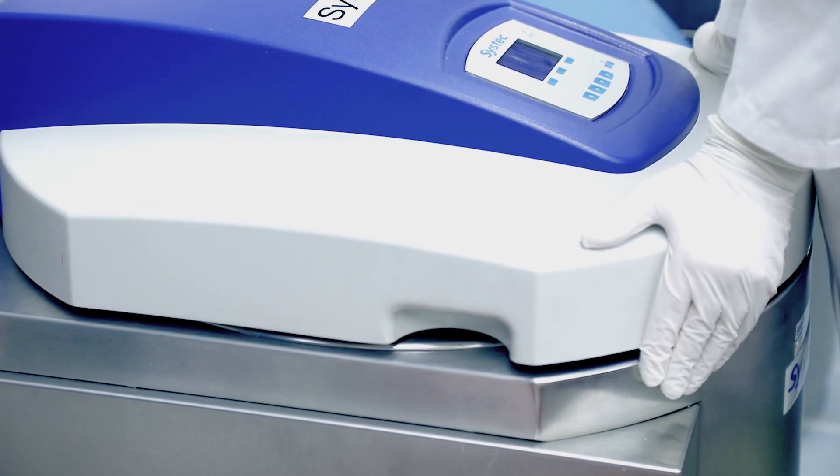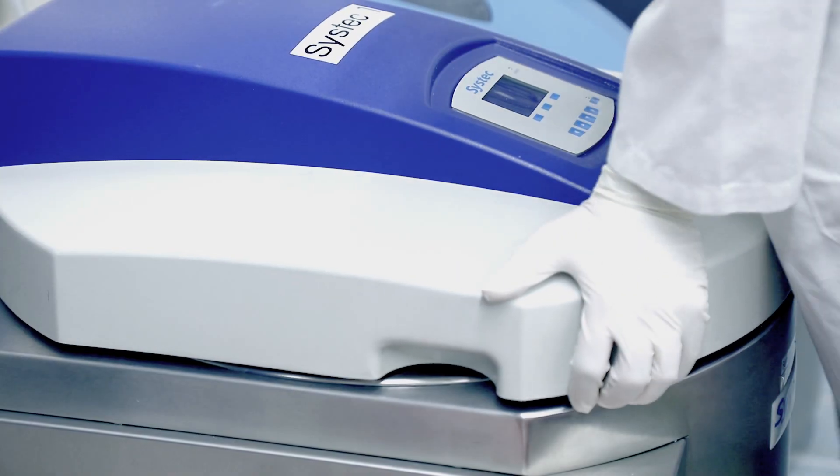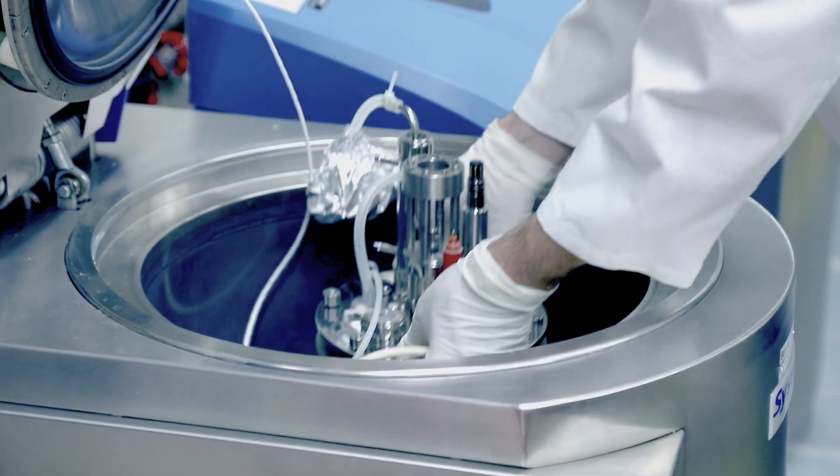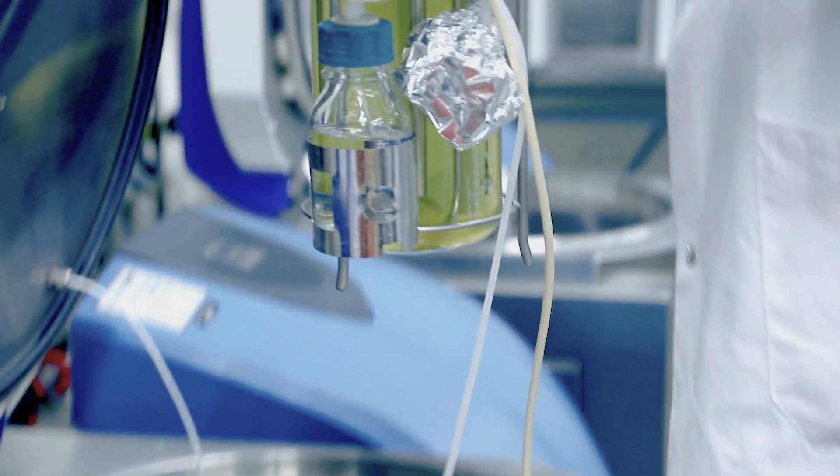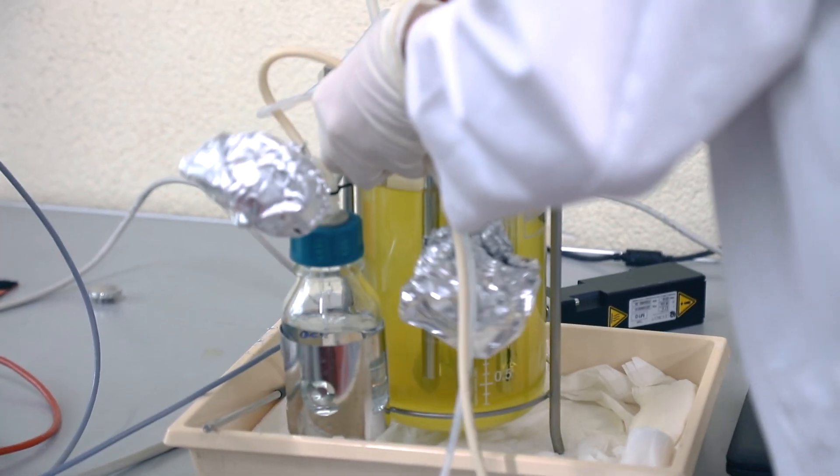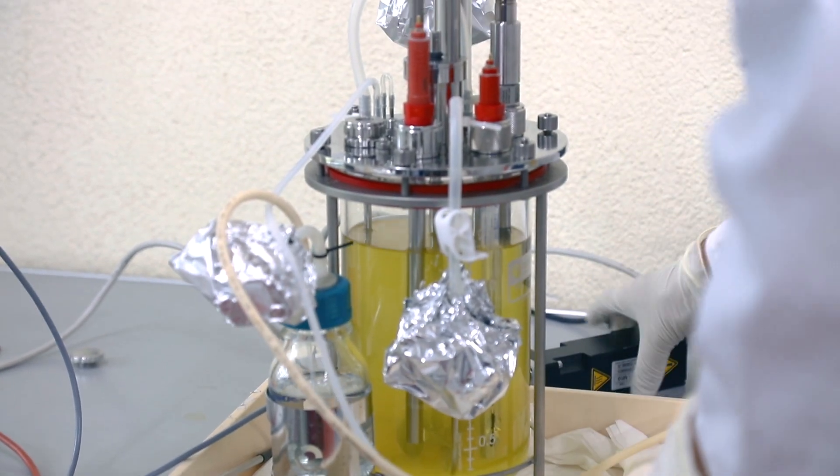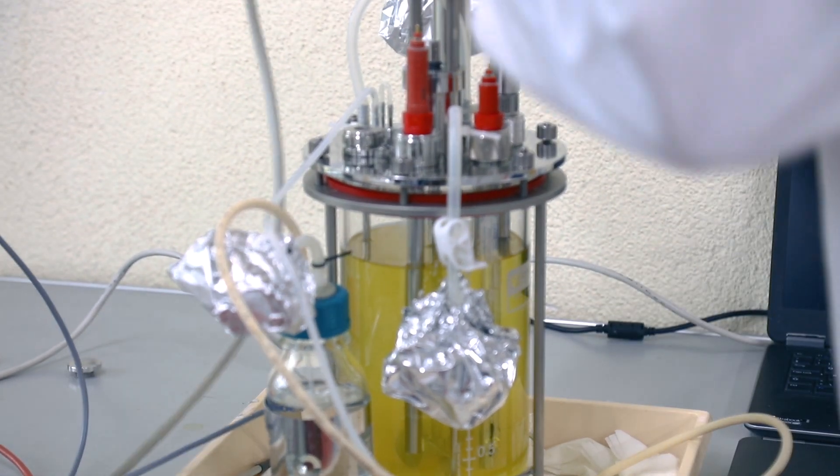The pH probe's slope value will remain stable over several autoclaving cycles, therefore eliminating the need for two-point adjustments. However, the autoclaving process causes an offset in the sensor's pH probe. This can be easily adjusted by performing an in-situ gas calibration.